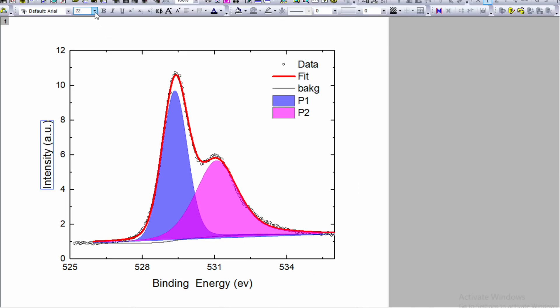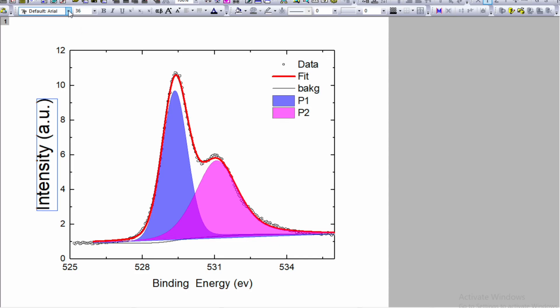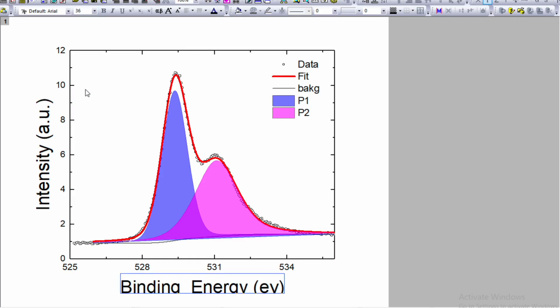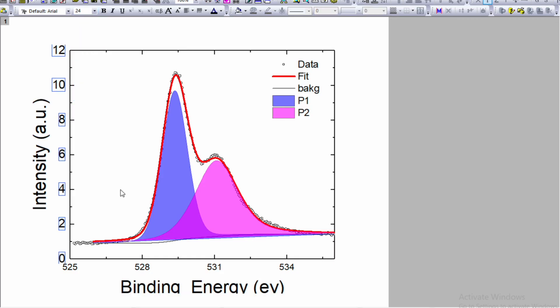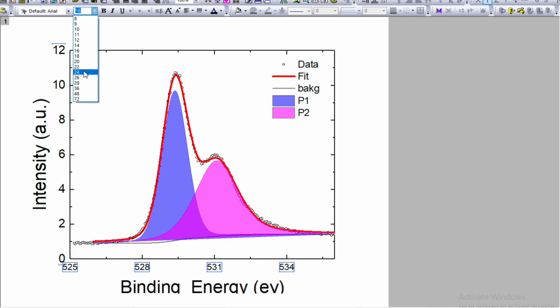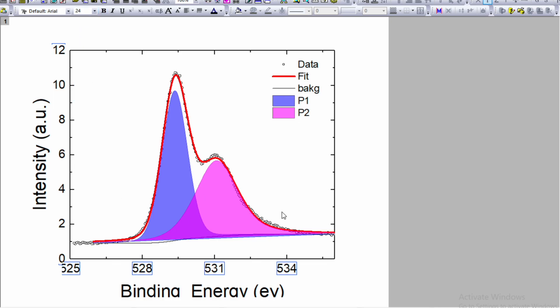Select this one, change font size to say 36. Similarly for binding energy, select the text and change font size to 36. Select the scale and change font size to 24. Similarly for binding energy, that is x axis, change to 24.